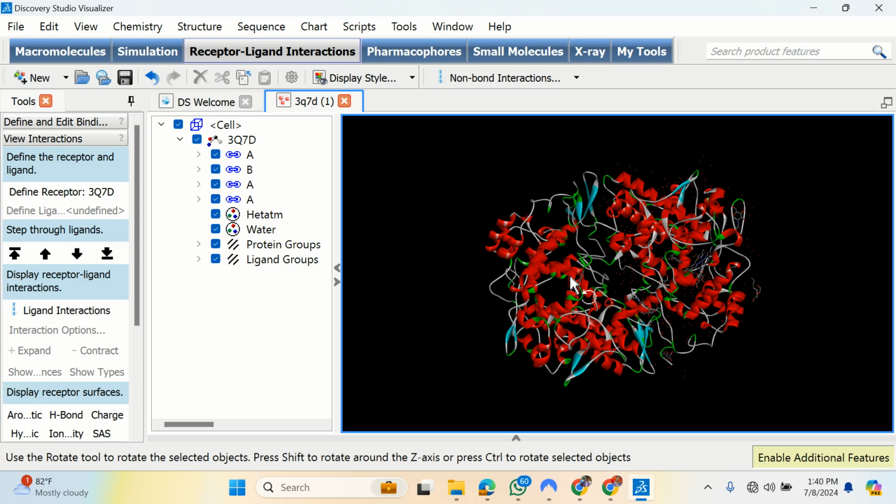You don't know that you have made a mistake, right? I'm just trying to tell you that if you delete something incidentally, and then you continue your work, and you now remember that Control Z can bring it back, a single Control Z will not bring it back. That's just what I'm trying to say. You keep doing it until it reaches where you deleted it.